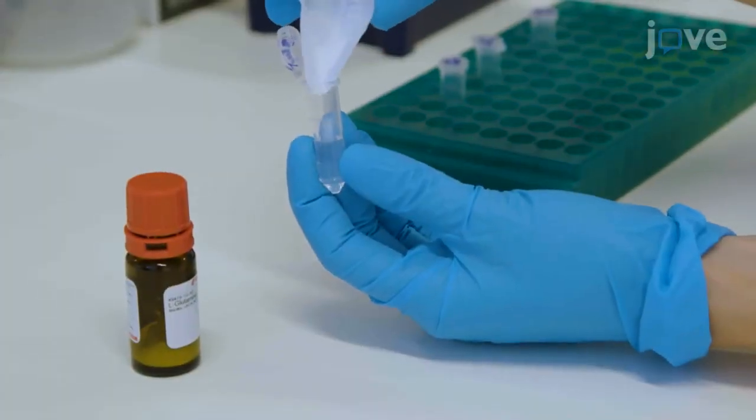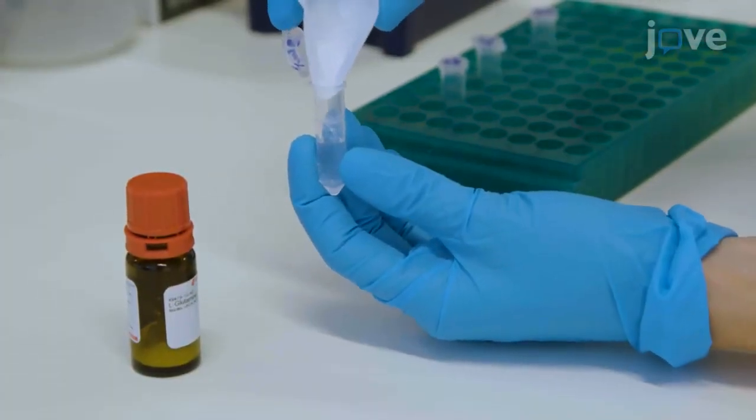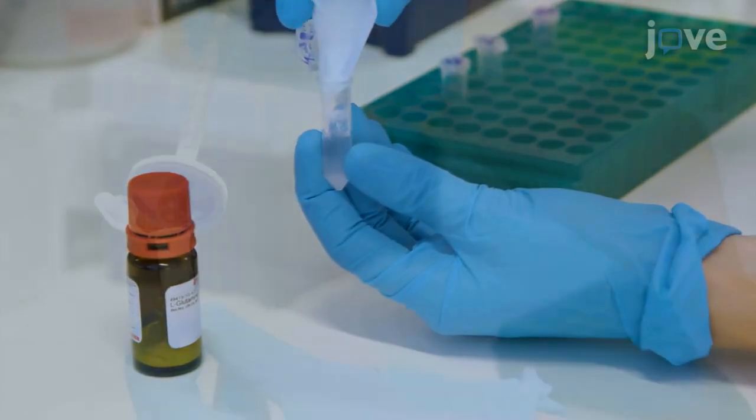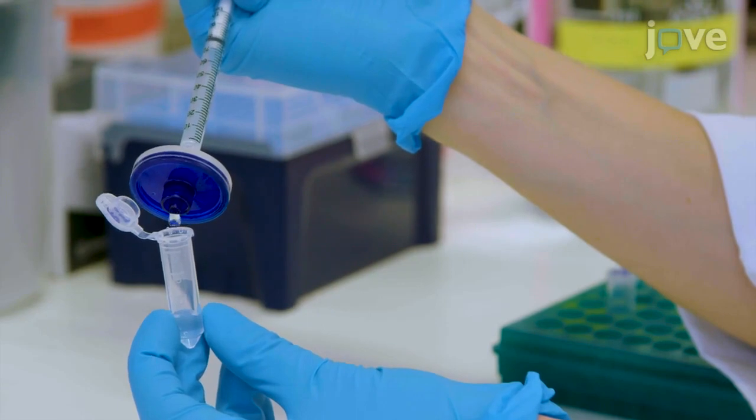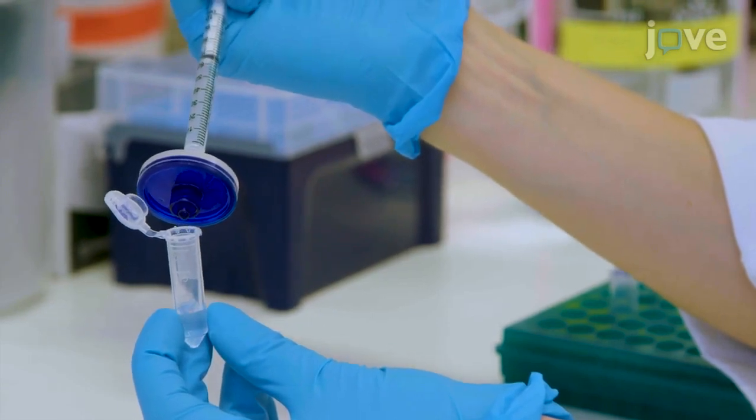Next, prepare a 10 millimolar solution of chemoattractant in 1 milliliter of the sterile medium and filter the chemoattractant solution with a 0.2 micrometer syringe filter to remove any particles and potential contaminants.